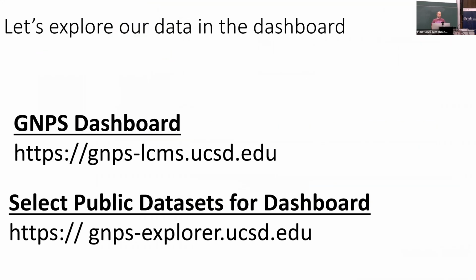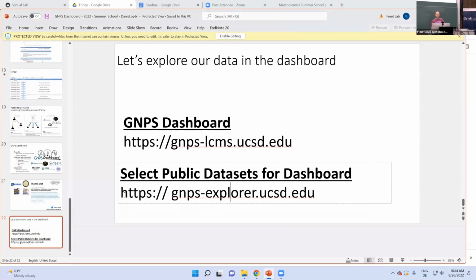All right, and now I guess most interesting for you, let's explore our data in the dashboard. I put 2 URLs here. One brings you directly to the dashboard, and the other one, which is perhaps even more important, brings you to the dataset explorer, from which we can load in data quite intuitively. I'll go to the web browser here.